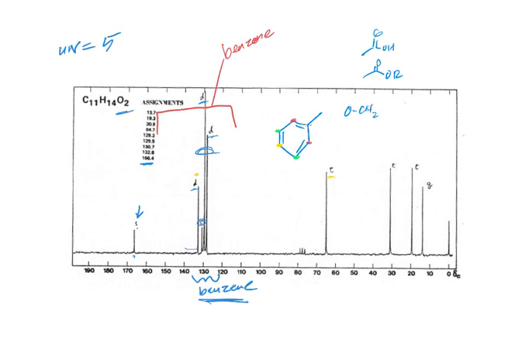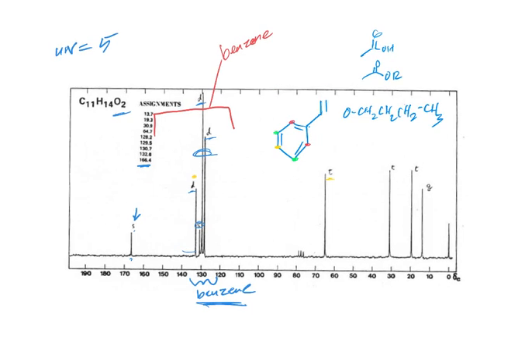So I think the easy way is just to put them all in a row like this, right? 3 CH2 groups and a methyl group. We've got a single methyl group. We can't have any branching or anything like that, and we don't have a CH in there for an isopropyl kind of group or anything like that. So we're just going to put our carbonyl right here.